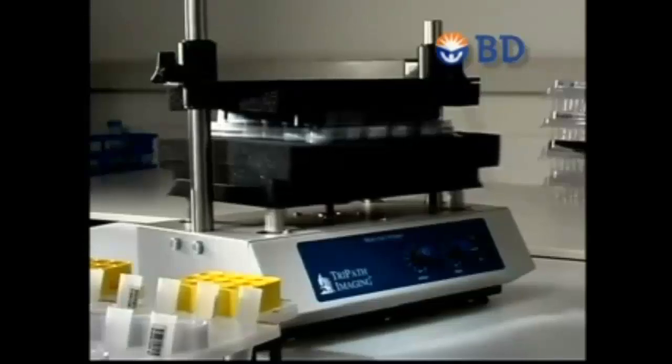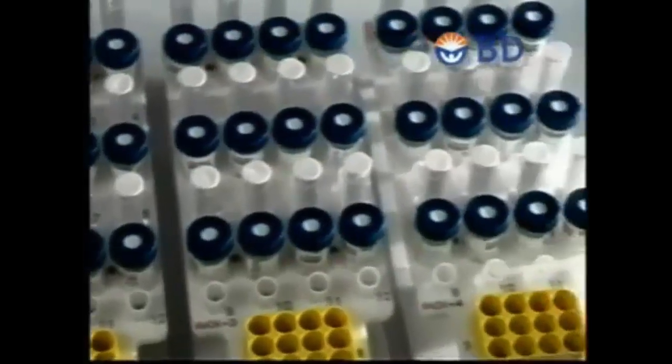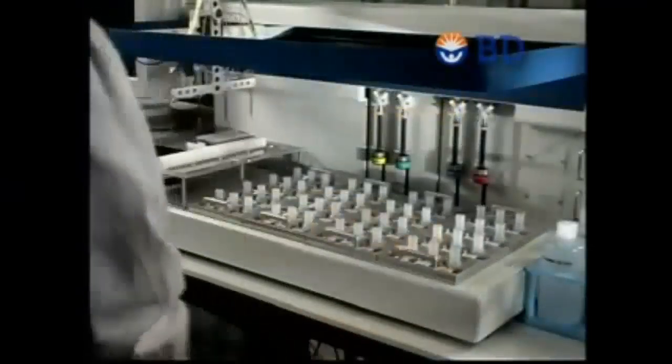Four PrepMate processing racks are provided and enable the organization and processing of samples. Each rack is numbered and keyed to accept only its corresponding centrifuge rack. This keyed system is maintained throughout the process, ensuring samples are always properly oriented.